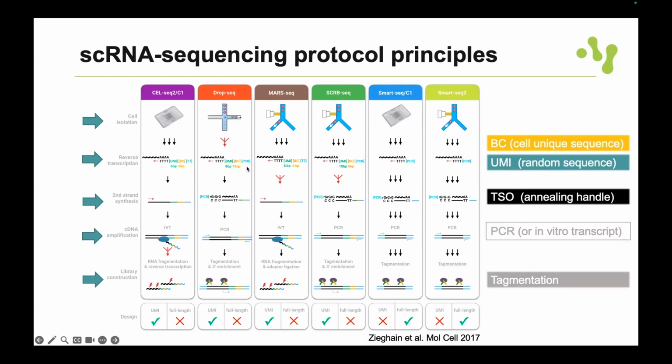Yes, but what I'm trying to ask is, how do we know that? Because at this point, we're still labeling all of the molecules inside of a cell. So in order to achieve unique molecular identification, you just load every cell with a lot of different unique UMIs.